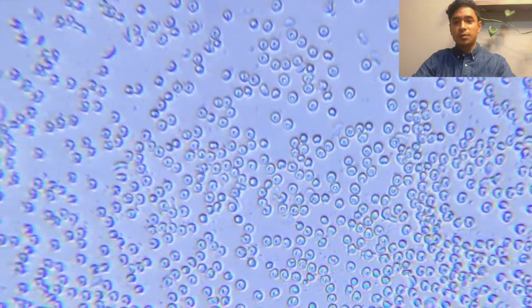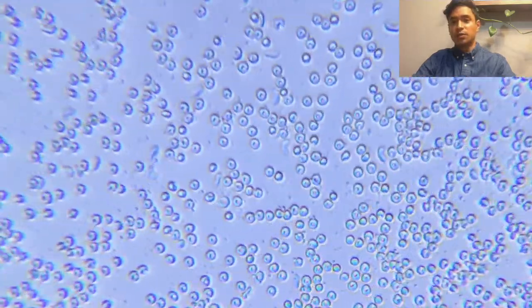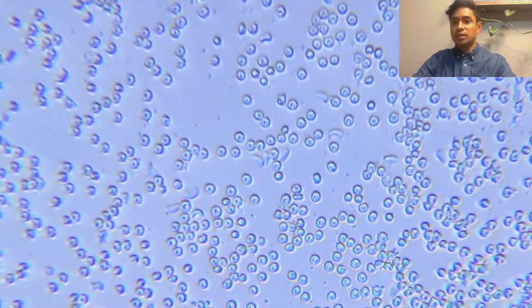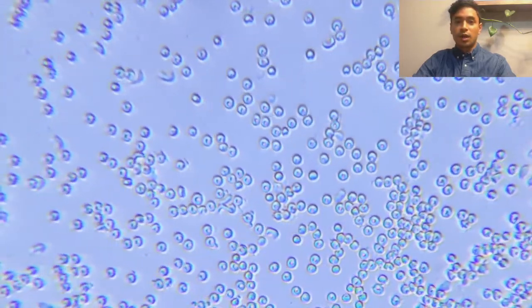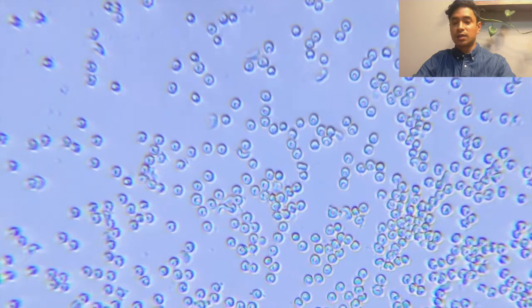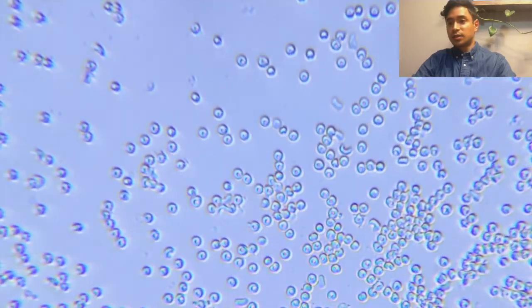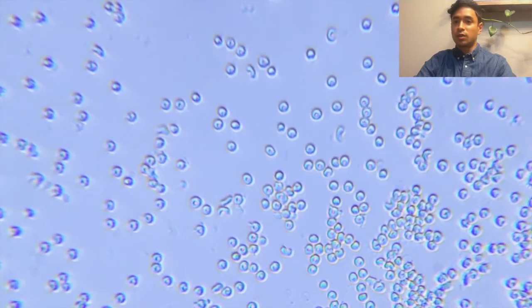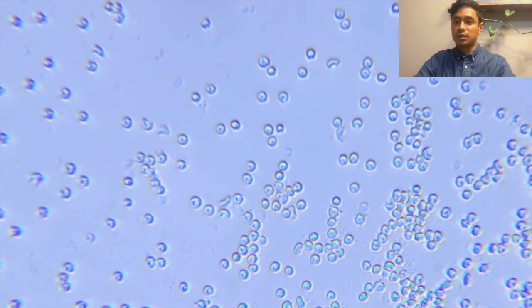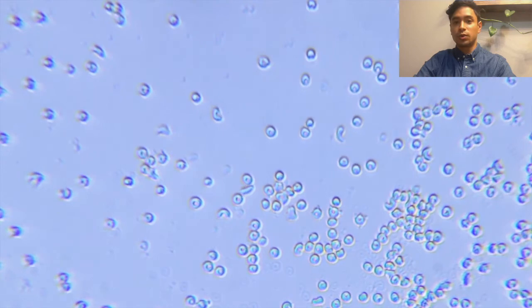This is a time lapse played at 120 times speed. Most of the cells are not sickled and are round and biconcave, while some of the cells are sickled. The cells here are moving only because the seal was broken on the right side of the cover slip because the lens housing was too close to the slide.